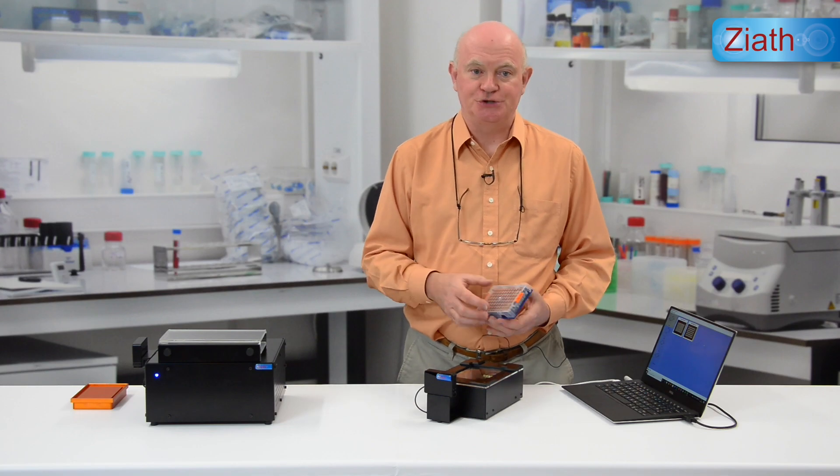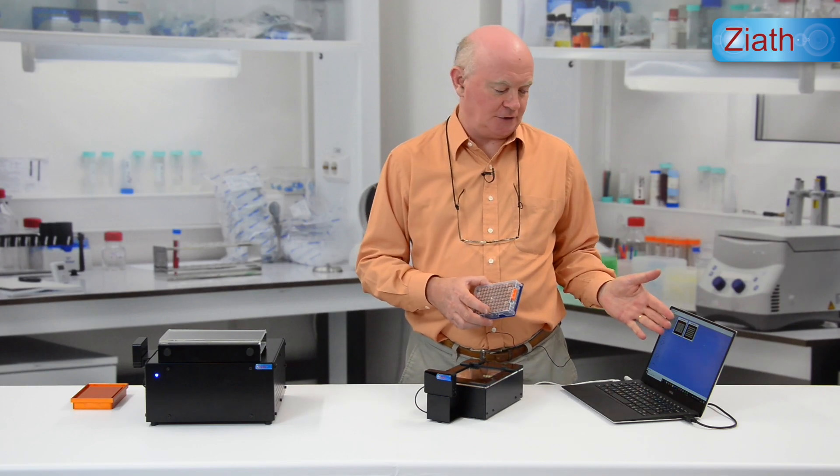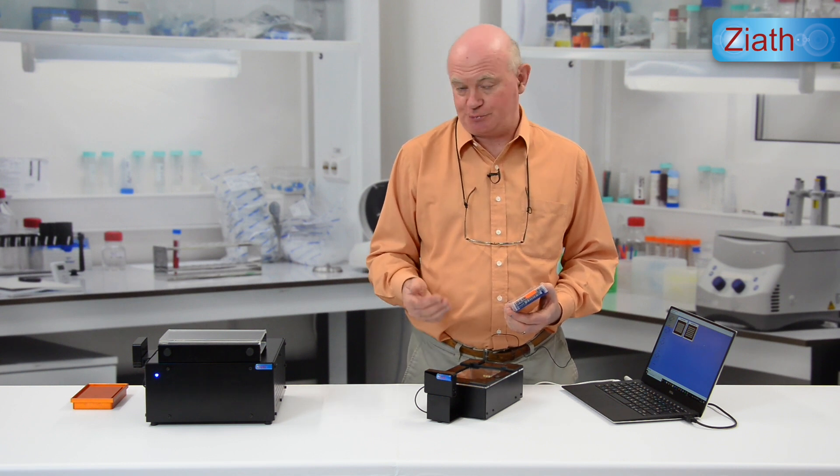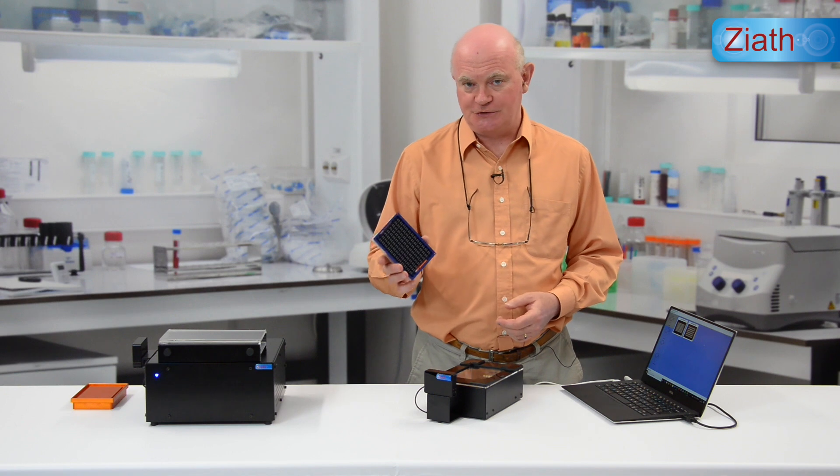There is a chargeable option to the Ziath Datapack software which enables you to use your existing Ziath Mirage Cube or Express scanner with Brooks Acoustics tubes.